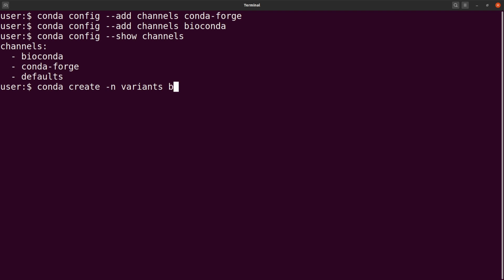We are going to use BWA, BCFTOOLS, samtools, sickle. We will also use Python, and then we will use BioPython. BioPython is a Python library. So these are the software or tools we will use for this exercise.